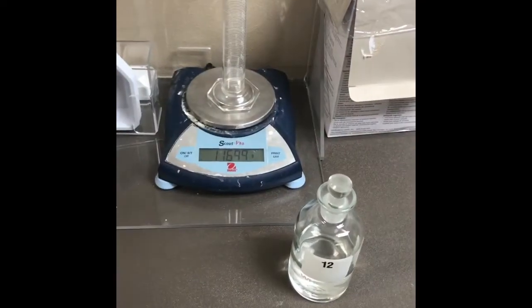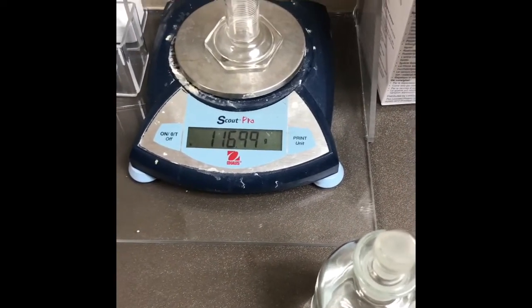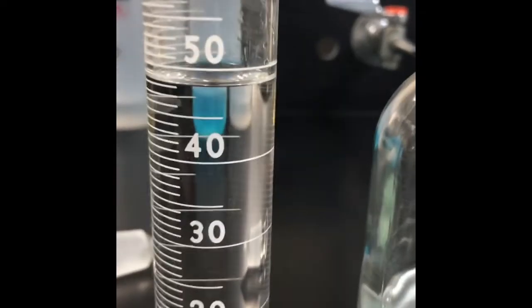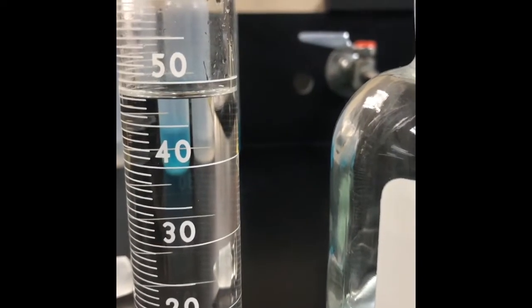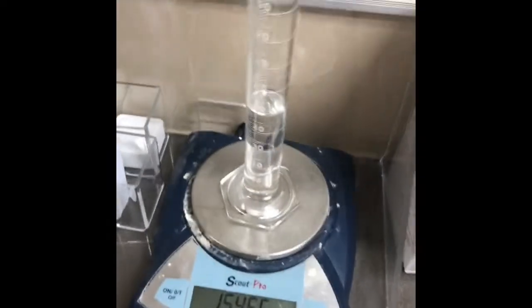We're going to repeat the same process for unknown number 12. It looks like the cylinder has a mass of 116.99 grams. Just like in the last portion of the lab, I measured out a volume of our unknown liquid, and it looks like it's right at 48 milliliters. Now I'm going to go back to the scale and weigh it.